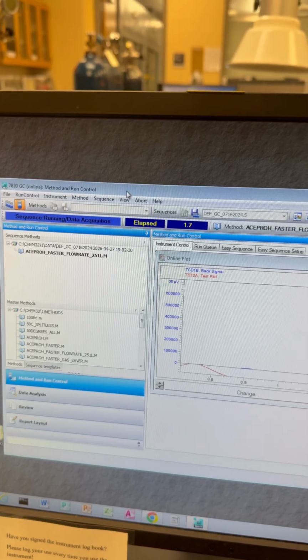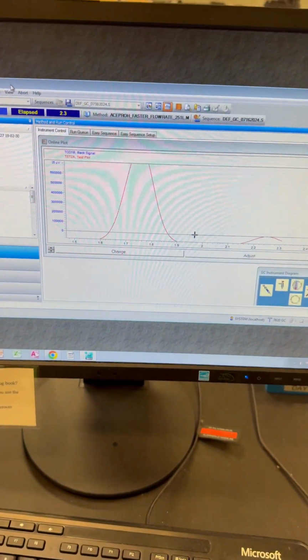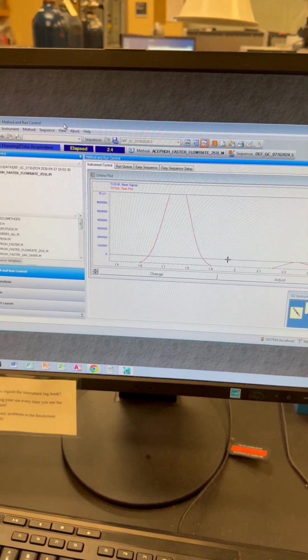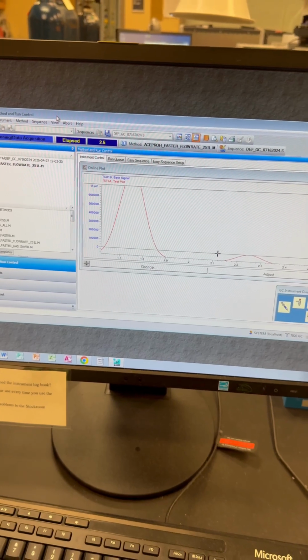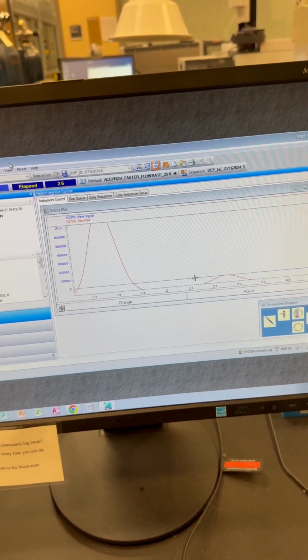After that, you pick the best flow rate based on the separation of the peaks that you see. The one that has more sharp peaks, more symmetric peaks, and more separated peaks. That's going to be the best flow rate you're going to choose. And then after you are done, you're going to go to the choose standards.